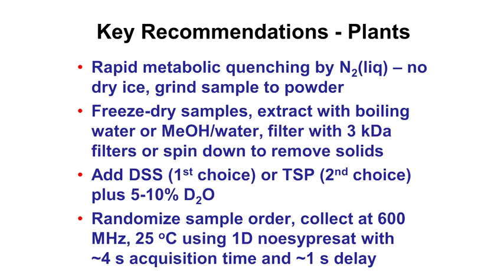Grinding is one way. Then you can freeze dry the samples if they started to turn to a bit of mush. Then you extract with boiling water or methanol water, and then filter, just like you did with the tissues, to get rid of both the proteins and other solids. Same thing, add DSS, add D2O, randomize the order, and collect with 1D NOESY presat.